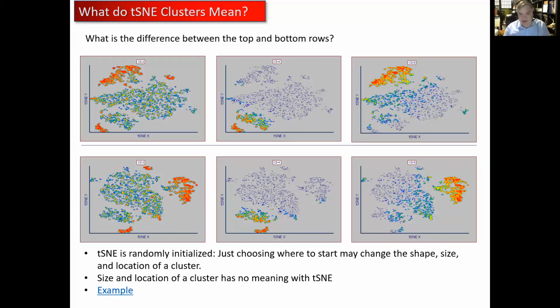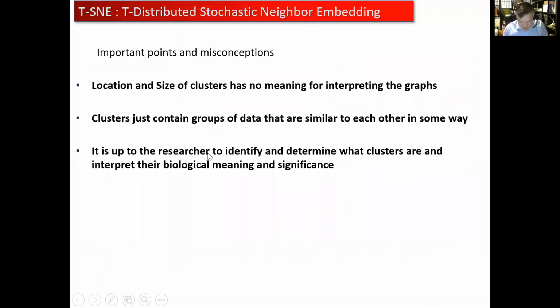Again, as I mentioned, there are other tools out there that do give you some sort of phenotypic information based on where the clusters are and how they're found. But again, we're going to be focusing on t-SNE today, and in that case, it doesn't have a lot of information. So again, these are important points and misconceptions.